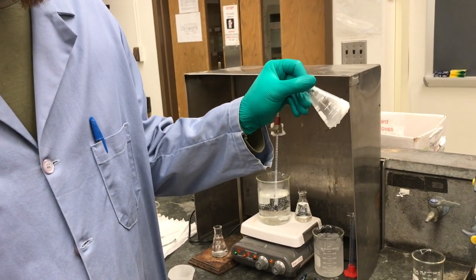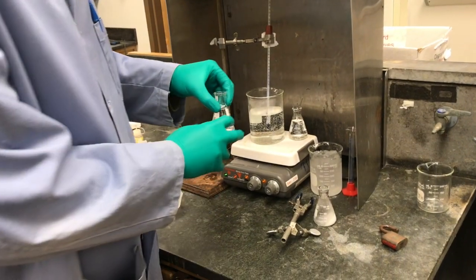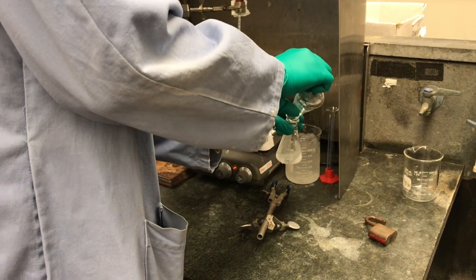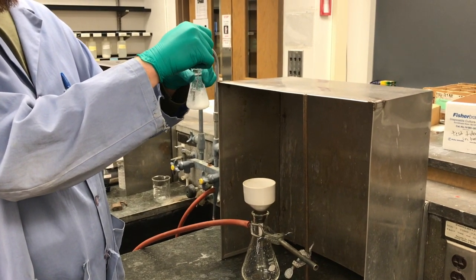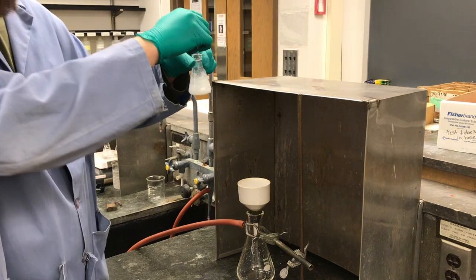After a minute or two, it's solidified. So we're going to add our 50 milliliters of water so we can do our vacuum filtration. Good. So I've mixed up and broken up that chunk of our crude product in the water, and I'm now going to filter that.